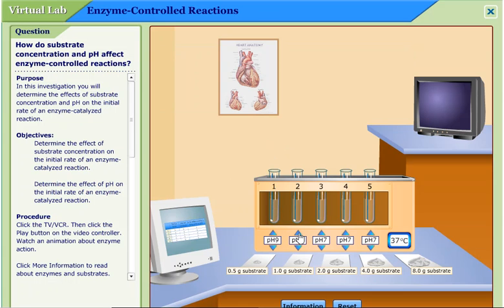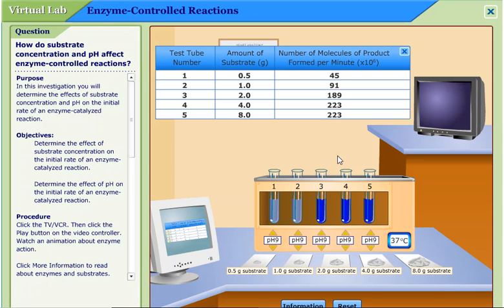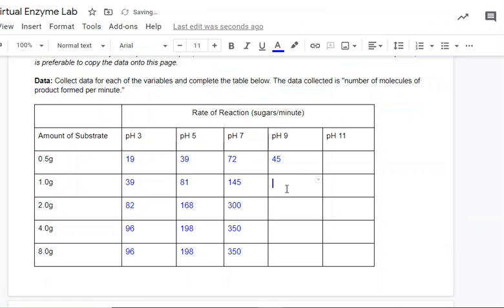Reset. This time we're increasing. As our pH number gets higher, the solution is becoming more and more basic — it's alkaline. At high numbers, pH 10 to 14 is alkaline. pH one to three is acidic. Anywhere close to seven is neutral. This time again, test tubes three, four, and five are dark blue. We get our readouts: 45, 91, 185, 223, and 223. Again, these last two numbers are the same — interesting.